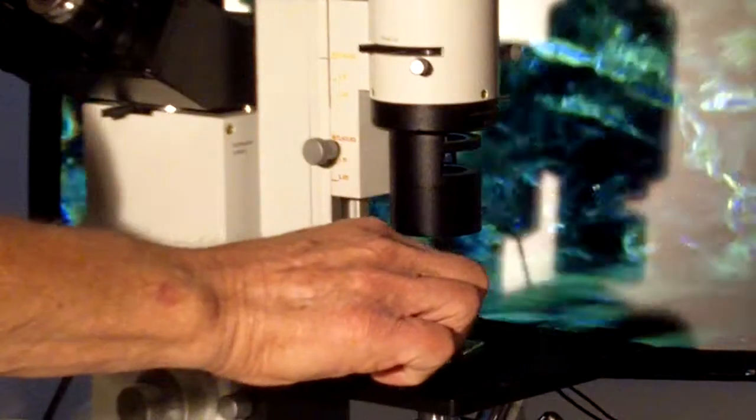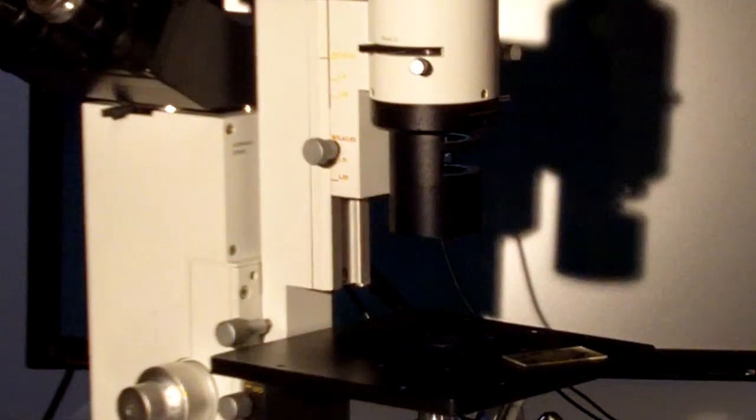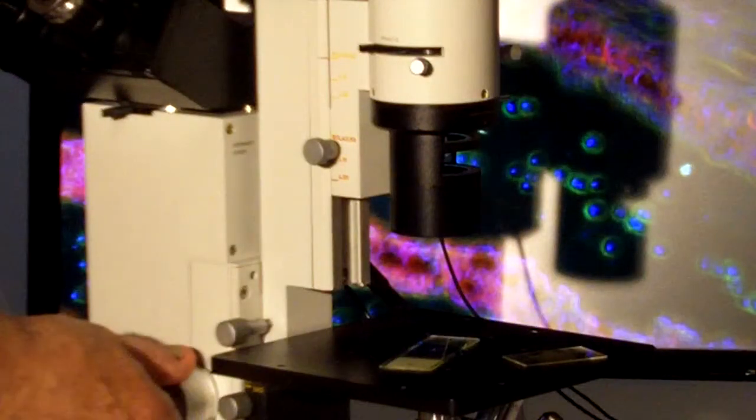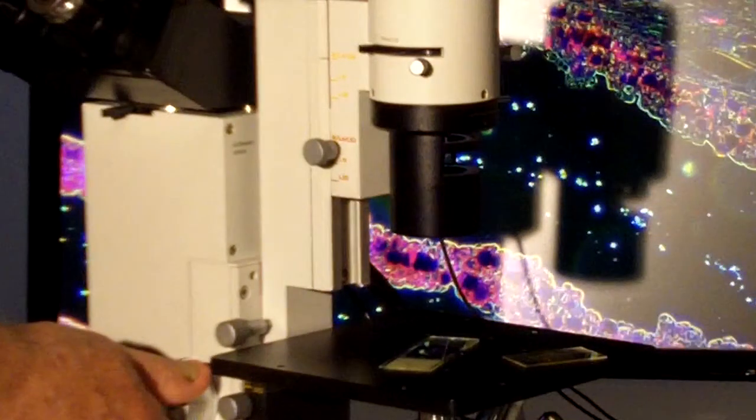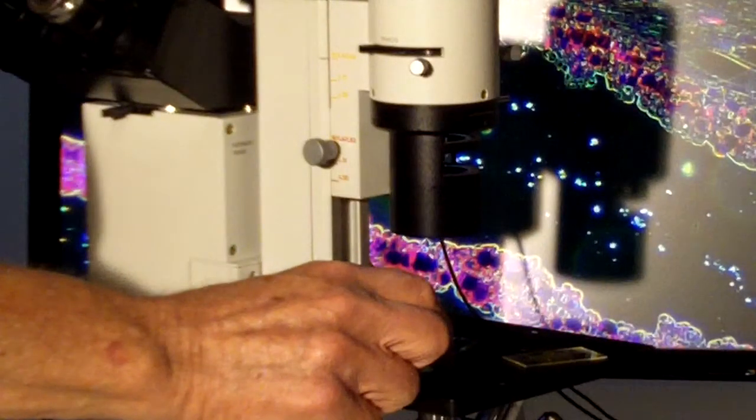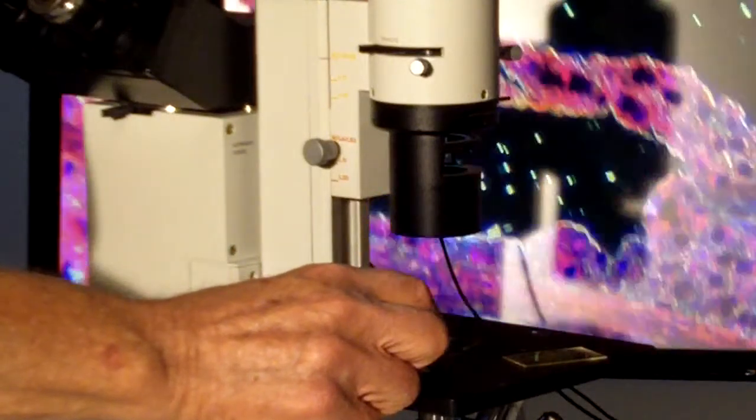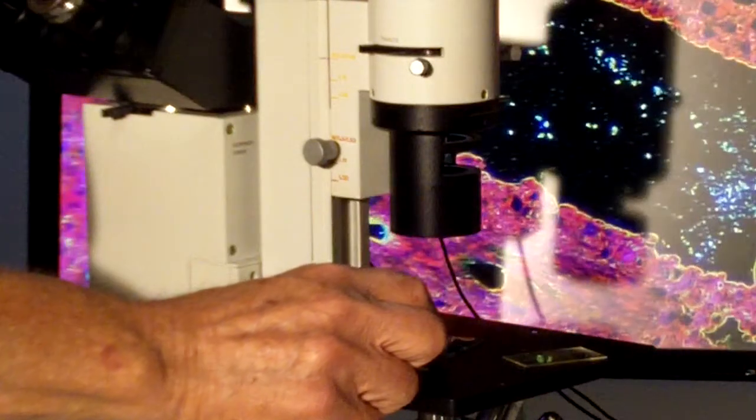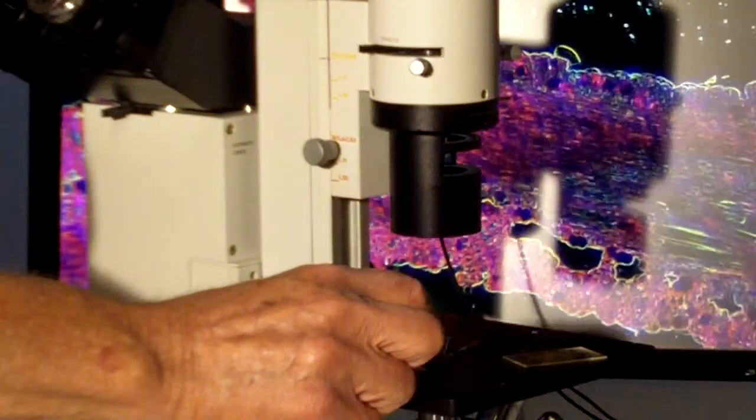And that can also be useful for things like our flower slide, thin section of the flower. Low power dark field adds a whole new contrast and detail enhancement for certain samples.